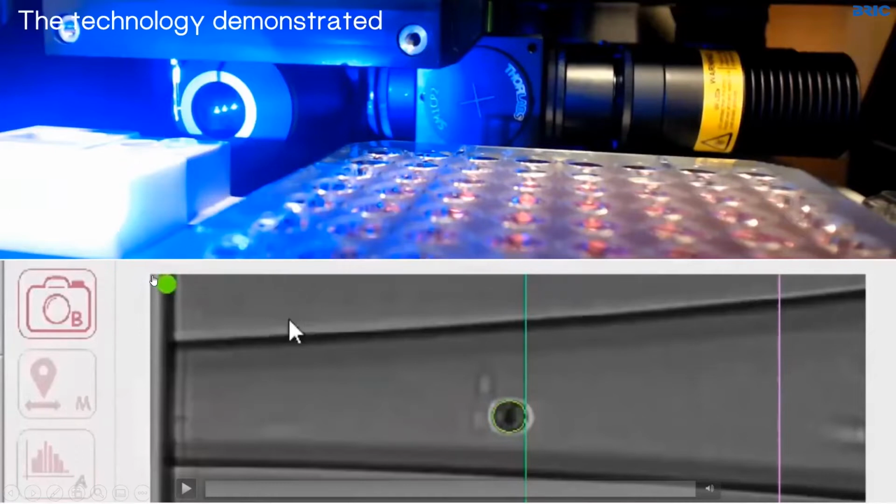So this is the tip of the dispenser, my boundary of the ejection zone, my sedimentation zone. Whenever I'm going to have a single cell in here on my image, I know that in the next droplet, I will isolate a single cell. So I'm now going to start the video, and you will understand better how the system works.